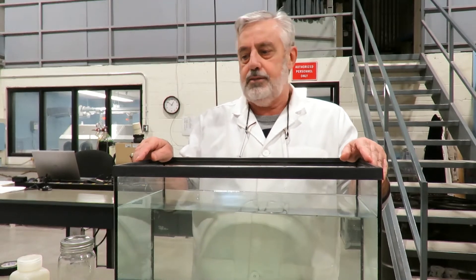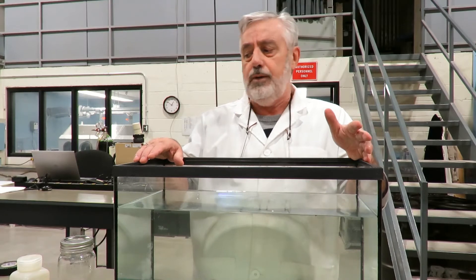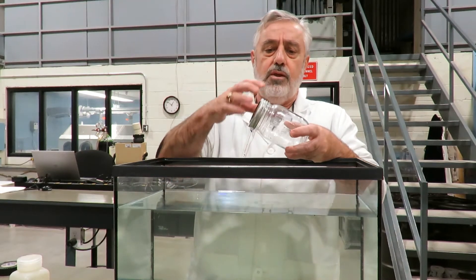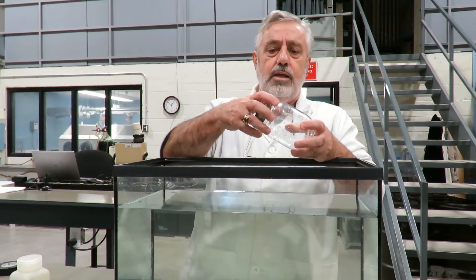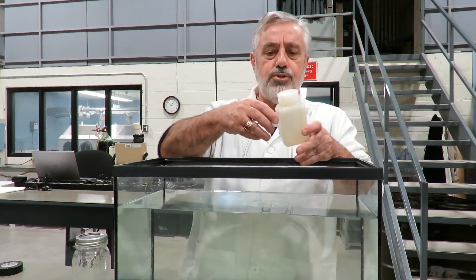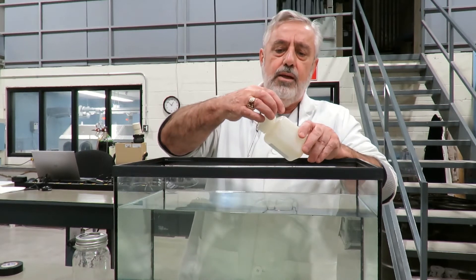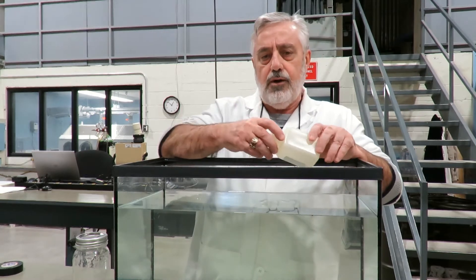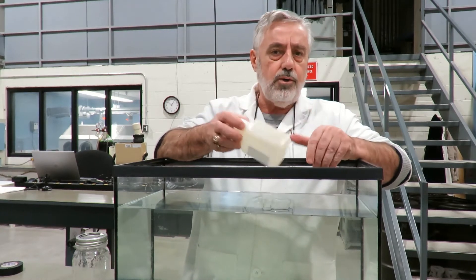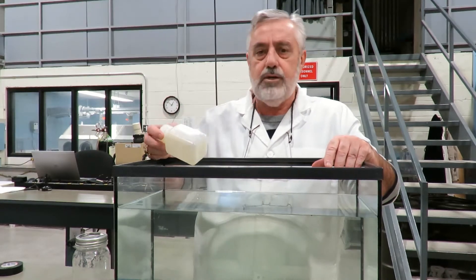Now that our bucket is filled — I'm actually using an aquarium here to show you how to collect the water. There are several jars on the market, but my preference is the old mason jar because it seals very well, has a very large mouth, and very small shoulders. This other type of container has a very small mouth and very extended shoulders, which is a problem because it's very hard to fill without trapping air in the corners — creating bubbles, splashing, and agitation, which results in loss of radon.